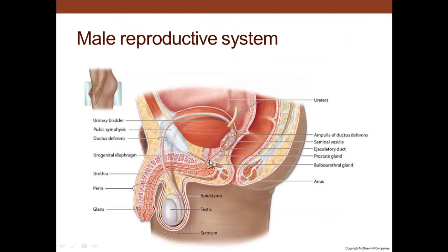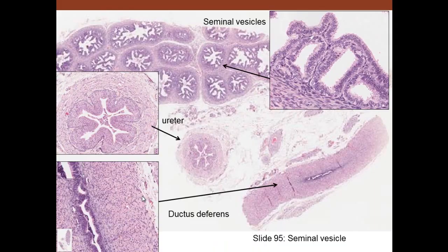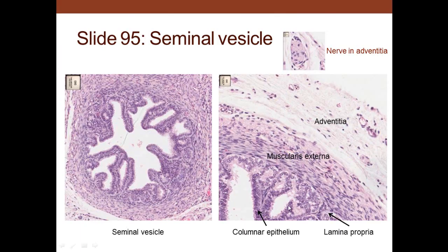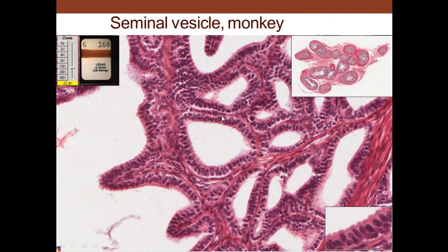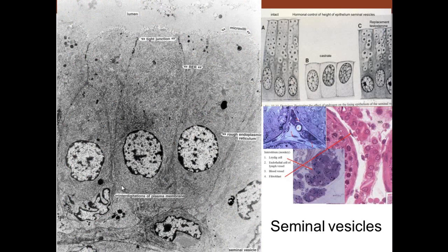In the male reproductive tract we have the seminal vesicles, the prostate, the ejaculatory duct, the urethra from the bladder, and then the penile urethra. The seminal vesicles have a honeycomb shape with simple columnar cells. In slide 95 you can also see the ureter and a longitudinal view of the ductus deferens. The seminal vesicle has a muscularis externa on the outside, columnar epithelium, lamina propria, and adventitial tissue. The cells show a lot of rough endoplasmic reticulum, and the height of these cells depends upon testosterone produced by the Leydig cells in the testis.